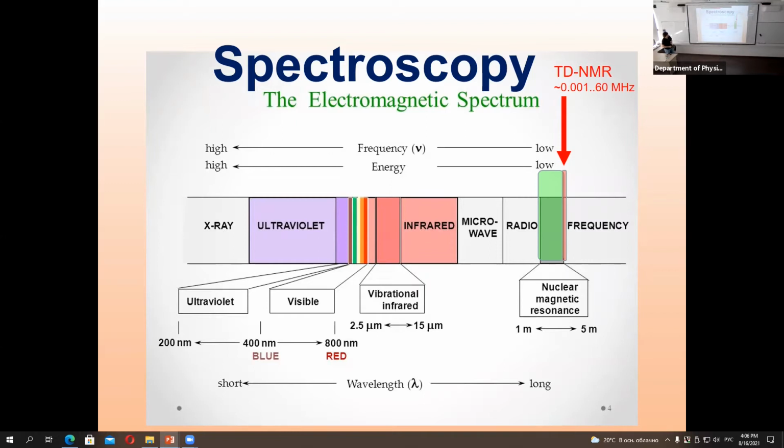So for time domain NMR, it is between very low field, where you can get the NMR signal even in the field of our planet, and, let's say, the upper border of time domain magnetic resonance, which is normally restricted by the power of permanent magnets that are now mostly used in NMR relaxation. So this is the time domain, this is a very narrow band.